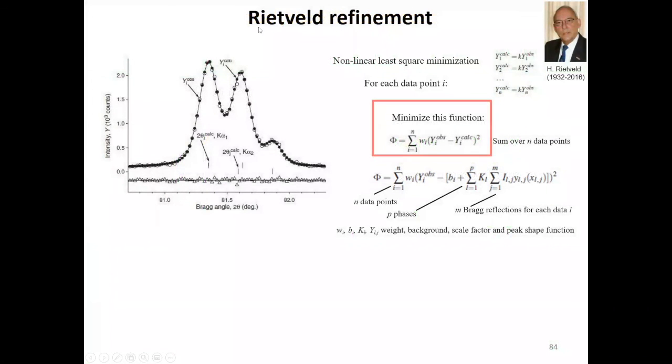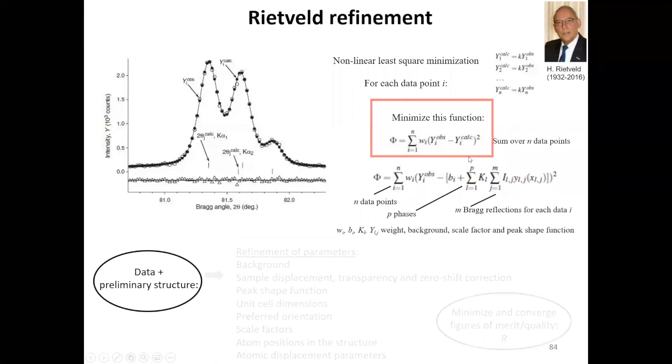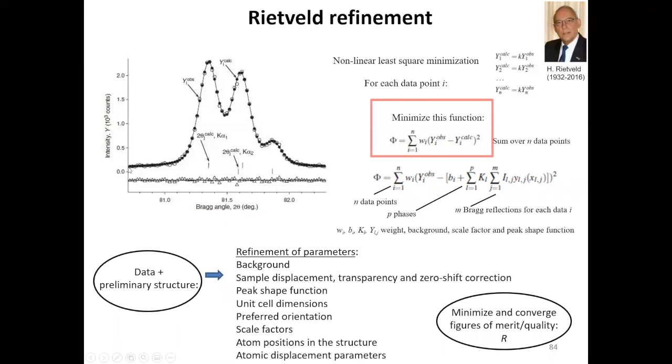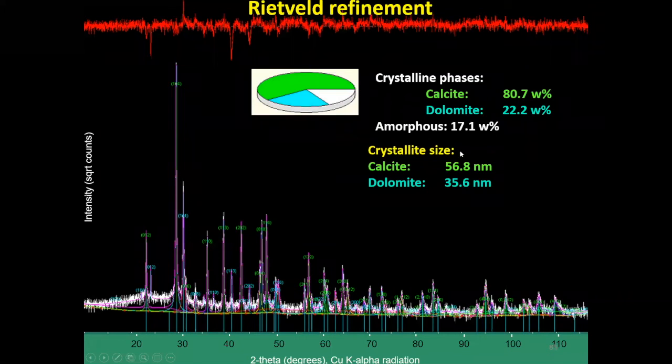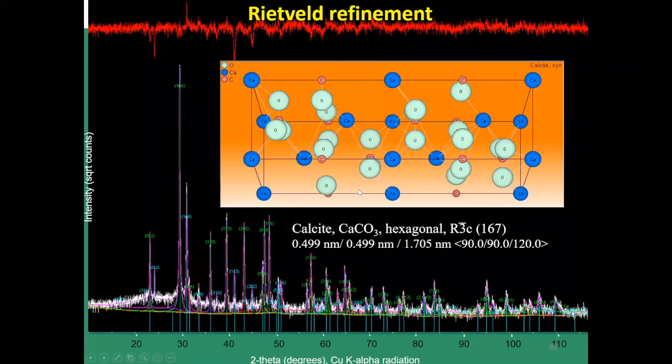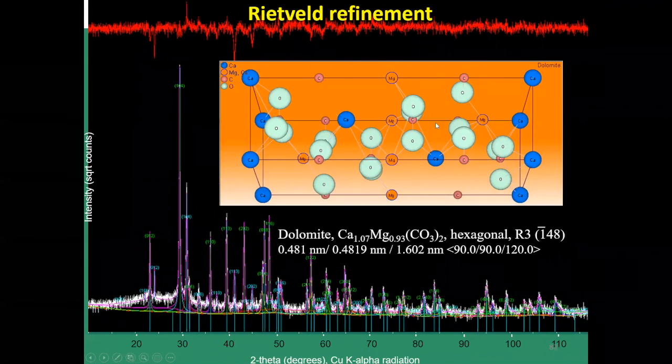So there are a lot of pitfalls. You can get the atomic structure, the 3D reconstruction of the material. There are a lot of pitfalls when you do quantification. Most of the ones we see are that people are using the wrong type of calculation for the peak areas. They are not taking into consideration the correct corrections for the peak intensity. There are many methods, including Rietveld, and they often do not have the proper data; the data does not have good enough density for the structure refinements. Let's quickly move on. Okay, what else?